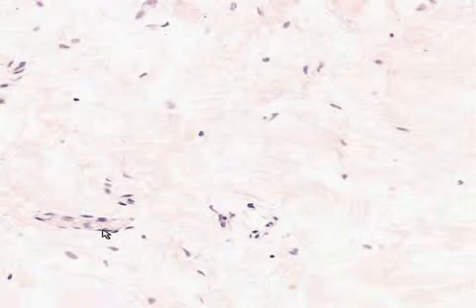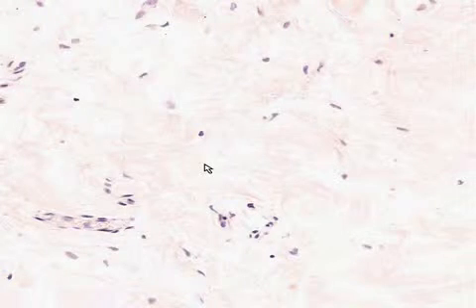The notable exception to that rule is if you see a spindly looking cell near the lumen of a blood vessel, like you see here. So that's probably a capillary. And of course, there's always blood vessels in connective tissue, like they could be anywhere. This is certainly some kind of small blood vessel. So when you see a spindly cell like here or here, and it seems to be lining the wall of the blood vessel, especially the part that's touching the blood cells, then that's almost certainly an endothelial cell rather than a fibroblast.